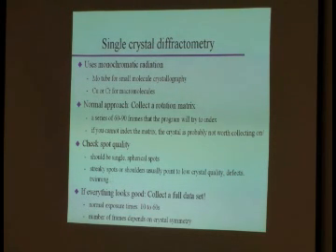The number of frames will also depend on your crystal symmetry, okay? And the program usually has some defaults in. At the beginning, your first few crystals, you'll be working with a more experienced crystallographer anyways, who can give you these insights. Oh, this is that in that system. We should certainly collect this many frames in that quadrant of reciprocal space, okay? They have experience with that. Listen to them. Ask them some questions. You know some about reciprocal space. These things will make sense to you, okay? Because you now have some idea of what these things mean.